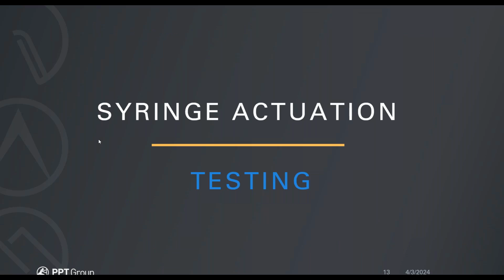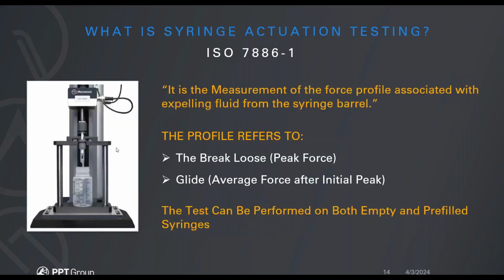So now we'll look at what the syringe actuation testing is. You hear it referred to as syringe actuation, you hear it as a syringe plunger test, you hear it as a break loose and glide test, which I think is more commonly used in the industry. What that essentially represents is a measurement of the force profile associated with expelling fluid from the syringe barrel. That profile refers to that break loose part, which is that peak force.